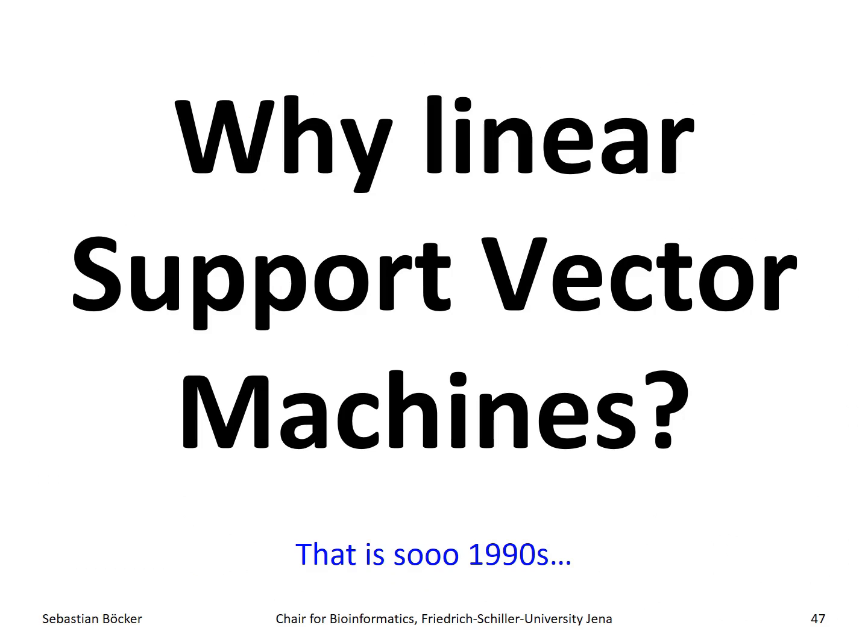Now, one question which we are asked every now and then is, why is CSI:FingerID using linear support vector machines? There are newer methods, cooler methods. There has been a machine learning hype, and support vector machines are so 1990s. Why are we still using them?